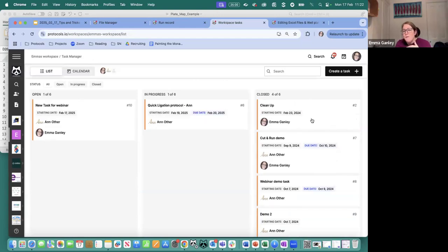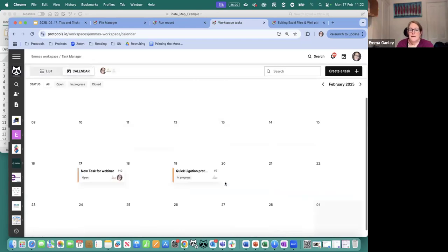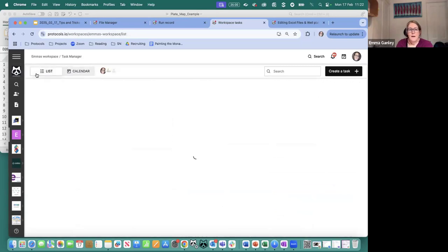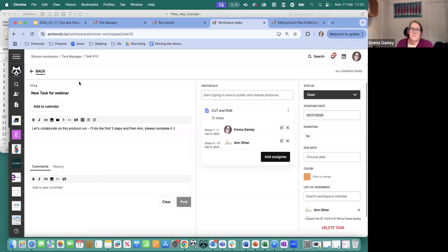You can see things at a glance. If I want, eventually, when they're fully done, I can just delete them. So I think probably people aren't keeping these after the fact. There's a couple that I just added recently, and straight away they're on the calendar view as well. So let's have a look at the new ones that I've put in here. So this one I'd added yesterday.